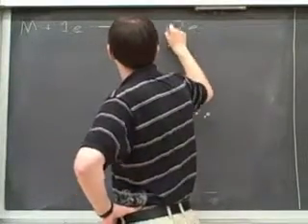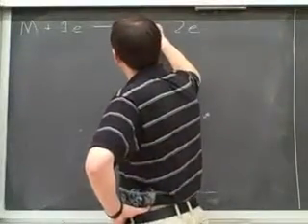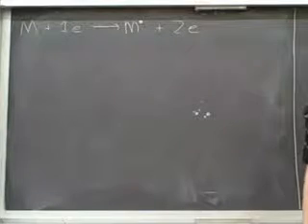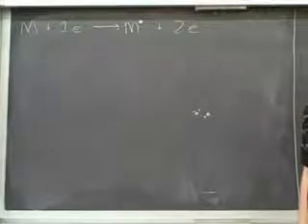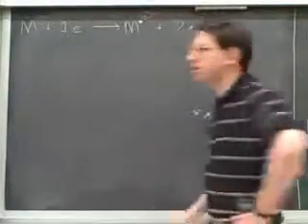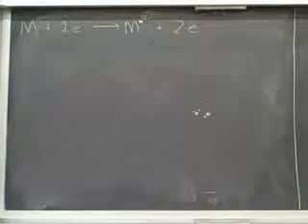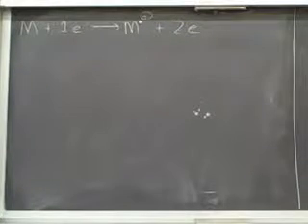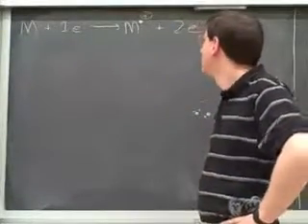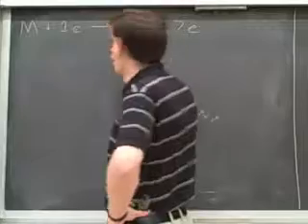So what should be the correct symbol for the molecule now? Well, now that the molecule has had one of its electrons knocked loose, it's a radical. We know that we draw radicals with unpaired electrons. And since it's lost an electron, it must have a positive charge. So the symbol we would use shows that this is a radical cation. And this is what we're going to call the molecular or the parent ion.